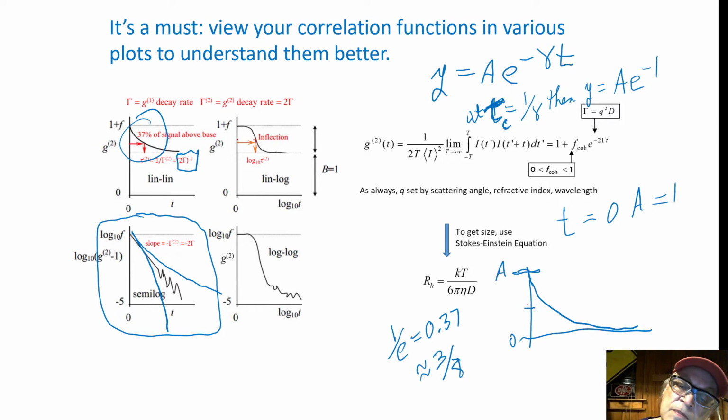So if I have a signal that is decaying from a to 0, then I can easily divide by 2. That's a over 2. That's a over 4. That's 3/8 of a. If I can figure out where that is, I can draw a line over here and reflect it, just bounce it off that curve, and this must be my correlation time.